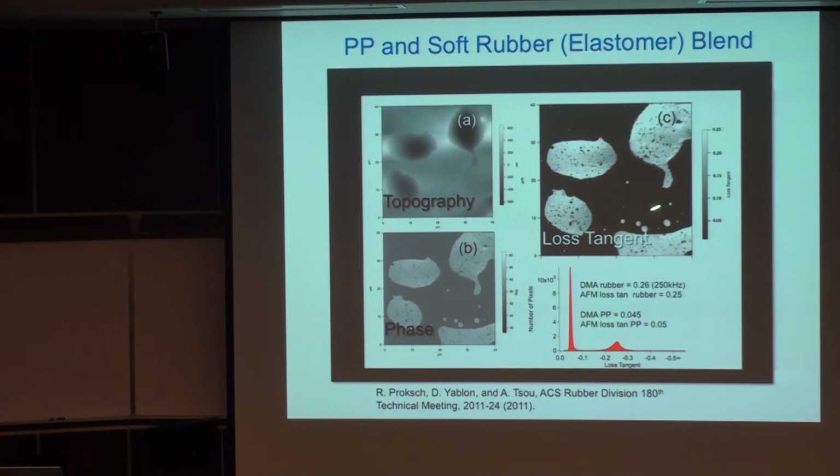So the beauty is that it's very fast to make this type of measurements, and it's not dependent on the shape of the tip. So very simple at the end. And now that this kind of feature is included in your software, you get that instantaneously. You do AC mode, and you get the loss tangent of your material.